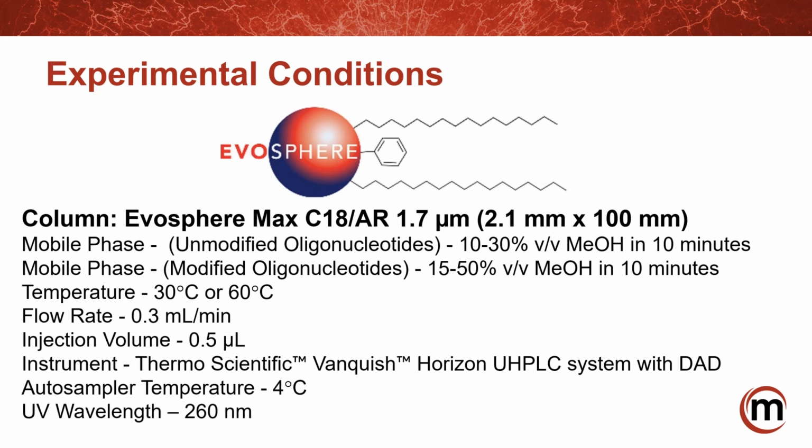This is just my opinion: because the surface area is so high and the bonded phase density is so high, we're seeing more moderate polar retention than what you would see in a standard packing material, at least what I've seen recently.